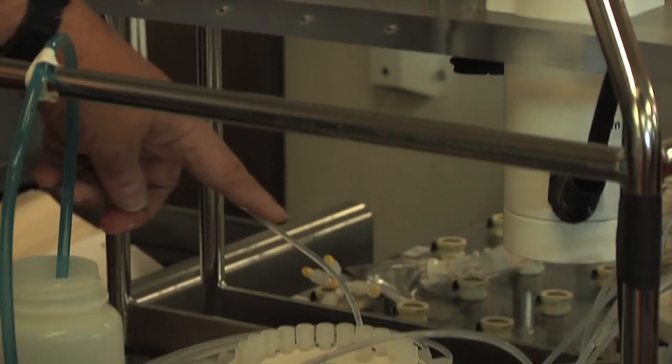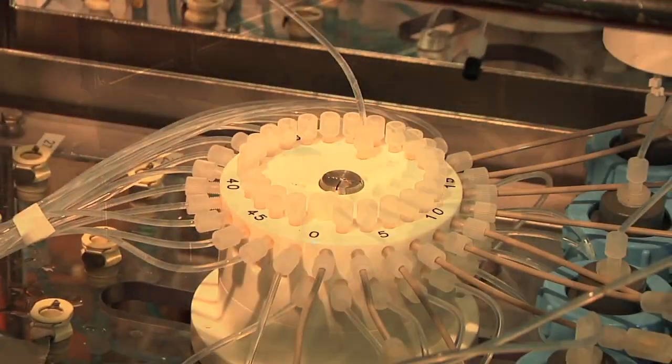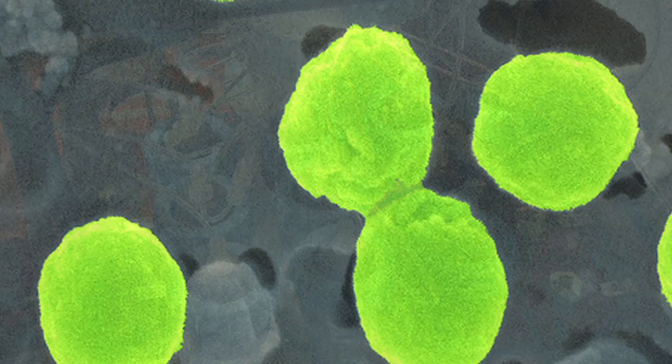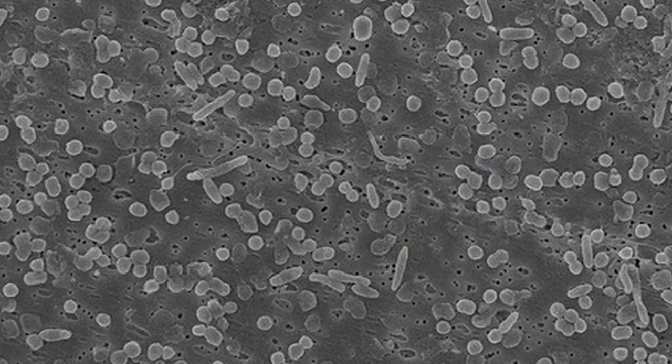At the end of the incubation, that sample is then expelled from the incubation chamber through a valve system to a filter that collects the particulate organic matter or the particulate algae that have now incorporated C13 bicarbonate into their cell tissues.